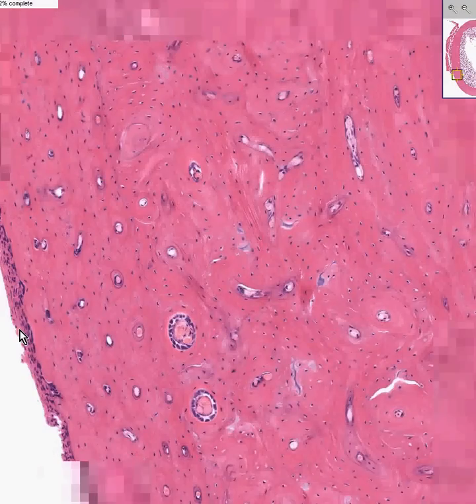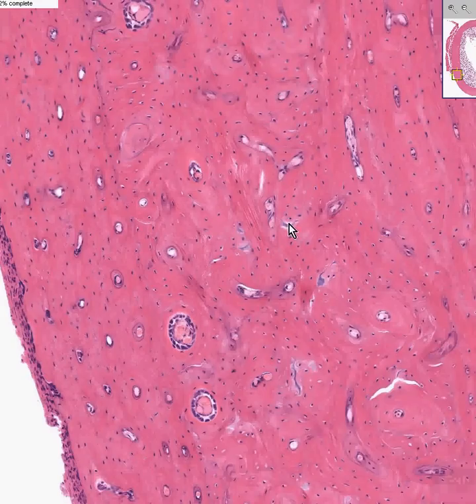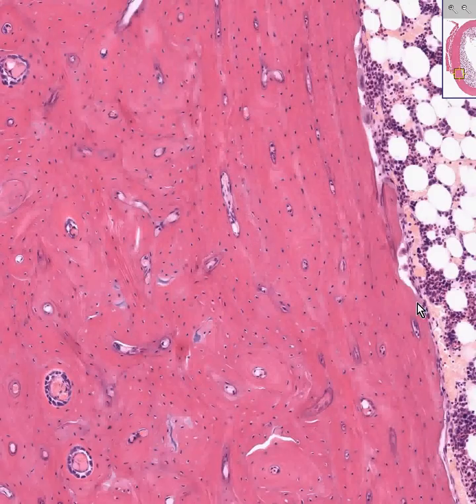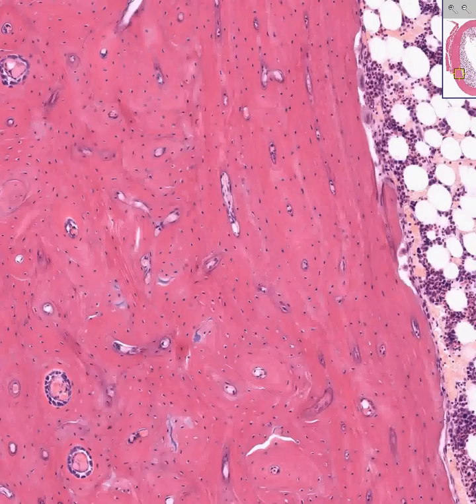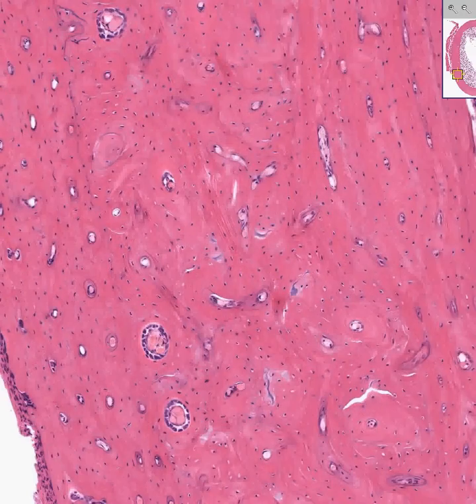In addition, you will see something similar on the deeper side of the cortical bone, and that will be some more boring-looking connective tissue, which is the endosteum. So we have the periosteum on the outside of the dense cortical bone and the endosteum on the inner side.